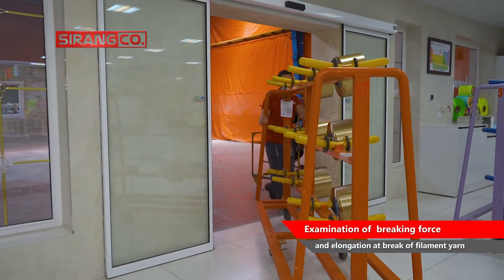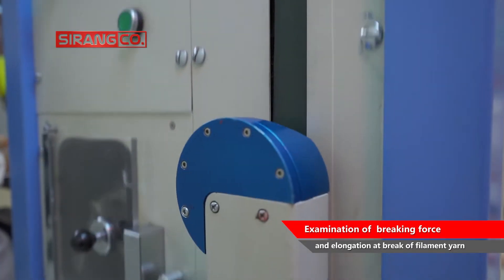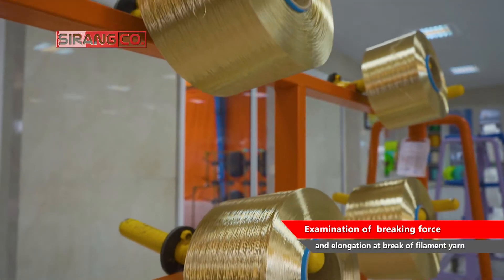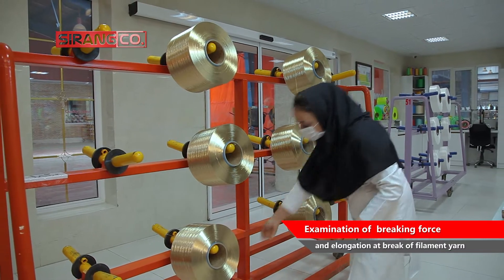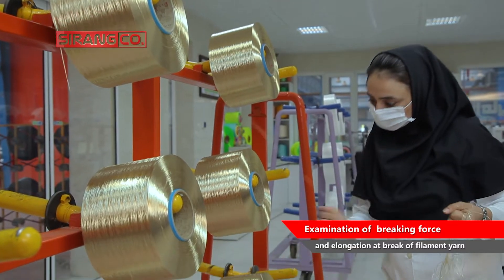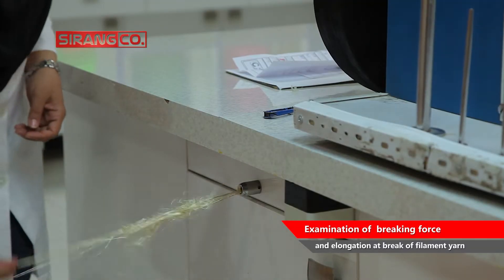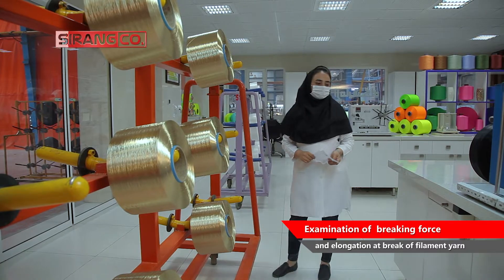For example, in the preparation of a rope that is used to lift heavy objects, force or tension should be considered when the yarn is torn, while for warp yarns in fabric weaving, the elongation at break should be considered. Or, the climbing rope should be made of fibers that have a high work of rupture, and it is not necessary that the tension to rupture be high.